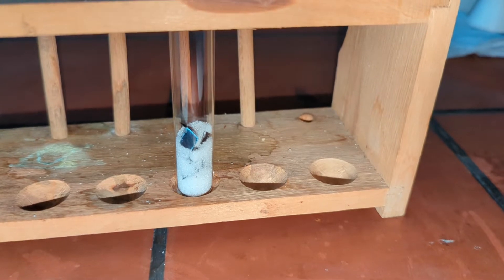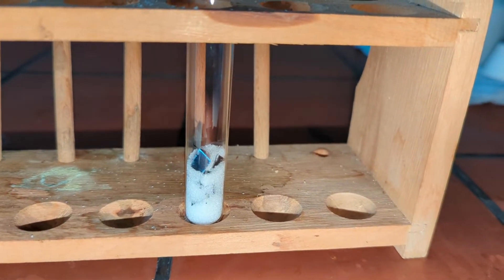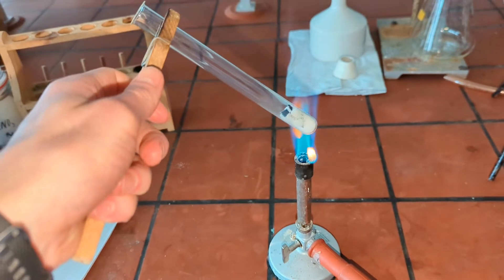We will need two substances: bismuth nitrate, which we made in a previous video, and potassium metavanadate.